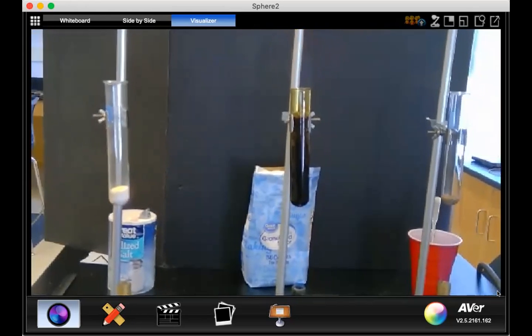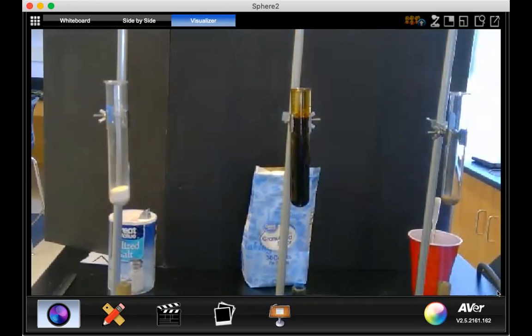Just about 5 more seconds of cooking and we'll reach our 4 minutes. All right. So now if you want to make your last observations, what you see happening, and I know for the sugar, of course, now is starting to look like it's about ready to overflow. I'm going to turn off that burner. The salt, we saw nothing happen. The lead is the hard one probably for you to see inside there.